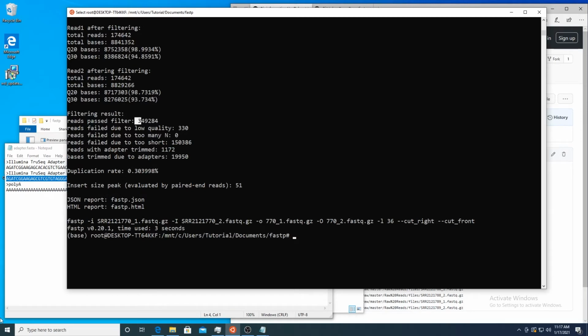Next, fastp can do what's called base correction using an overlap analysis. So of the forward and paired end read, you can have some overlap with your read, right? For base correction, you have to have this overlap with paired ends, which usually requires longer read lengths with a short insert size. So think of it as you have your read length. So right now we have, say, a 50 base pair read length.